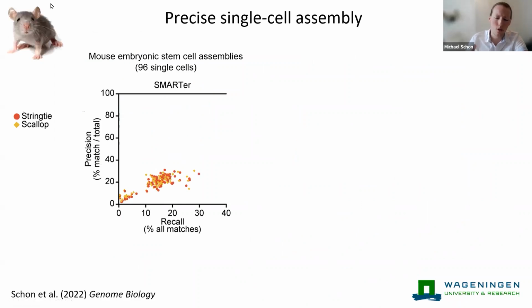And if we extrapolate into the actual RNA from the mouse embryonic stem cells, then we can see that whether these isoforms match the mouse reference annotation actually shows extremely poor precision. And Bookend, on the other hand, since it's aware of the 5' and 3' ends, is far more precise. We lose some sensitivity because single cell data is very incomplete. It's very hard to find reads from the entire length of a transcript from a single cell.